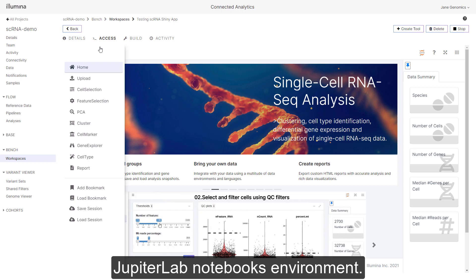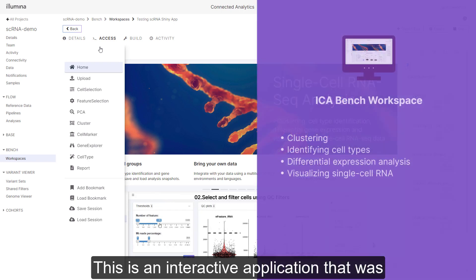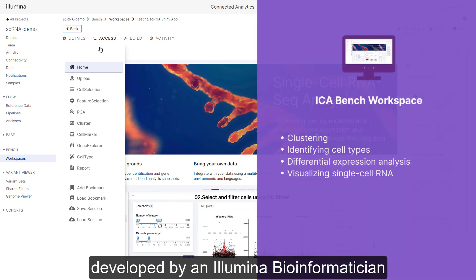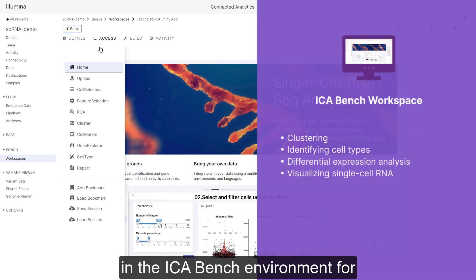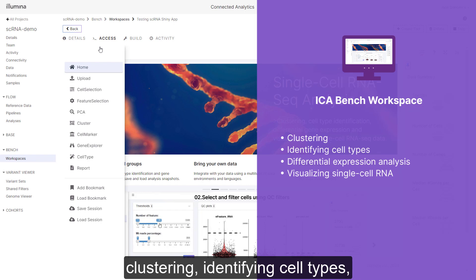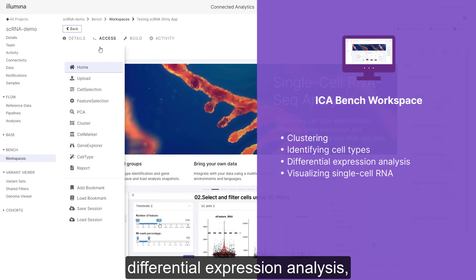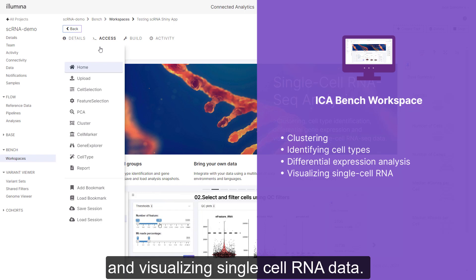This is an interactive application that was developed by an Illumina bioinformatician in the ICA Bench environment for clustering, identifying cell types, differential expression analysis, and visualizing single cell RNA data.